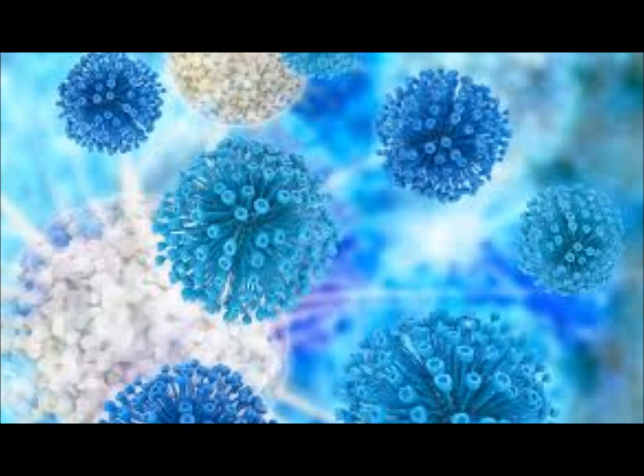That is 0.001 ml. That is 0.01 ml. So Laura will teach you a technique, because urine cultures are the first thing we do when we do real cultures in week 6. You're going to have to take the number of colonies and count them. She teaches you to do them in groups of 10. So if I used a 1 microliter loop, which is what we have, if I had 100 colonies, I will multiply them by 1,000. If I use a 10 microliter loop, I will multiply them by 100.